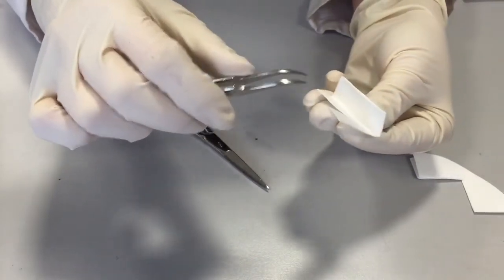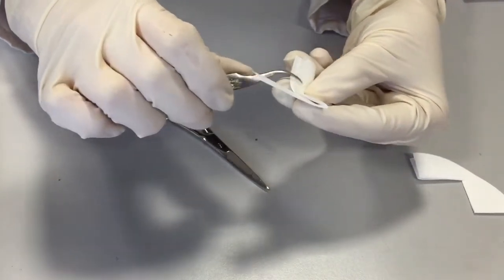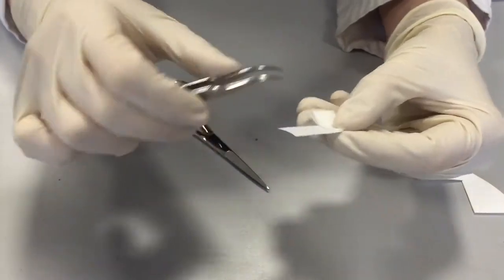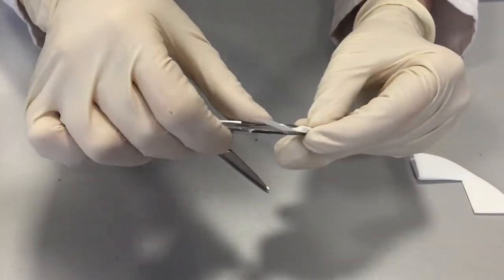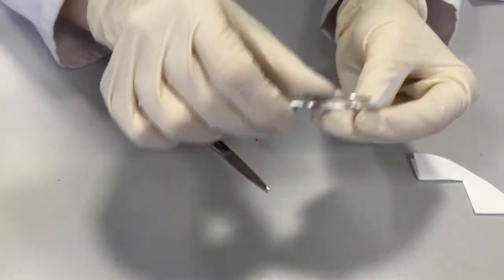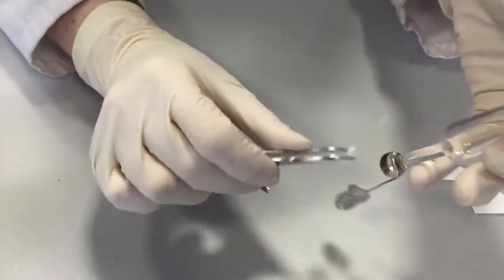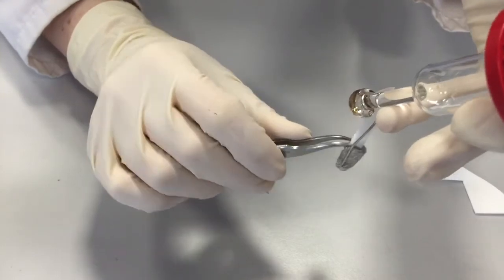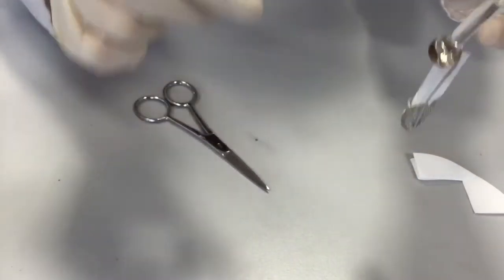Once you're satisfied your sample is in the centre, you fold it in this way: fold it in half, half again, and if possible half again, and then slot it into the basket like that.